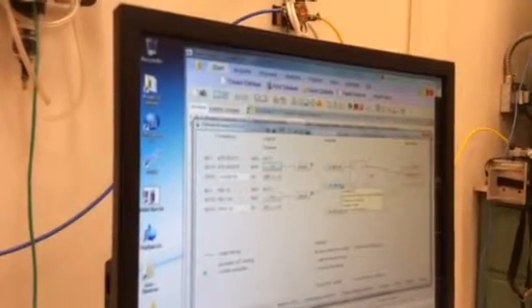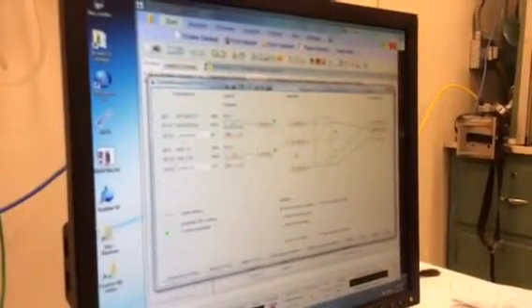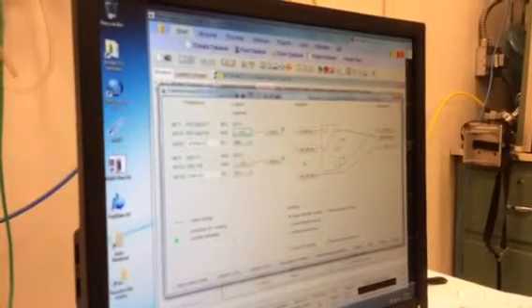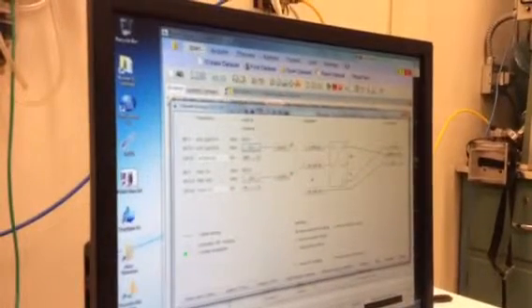Proton. Appropriate RF power. Cable wiring.